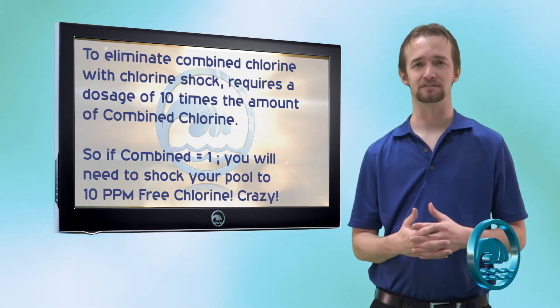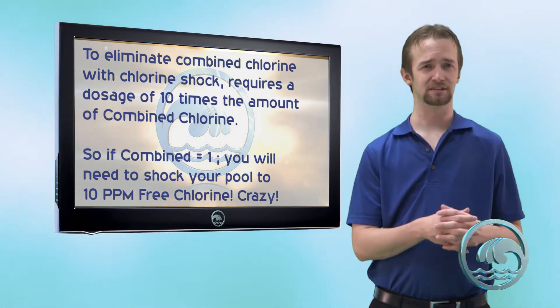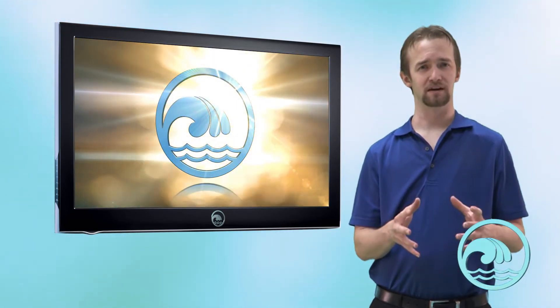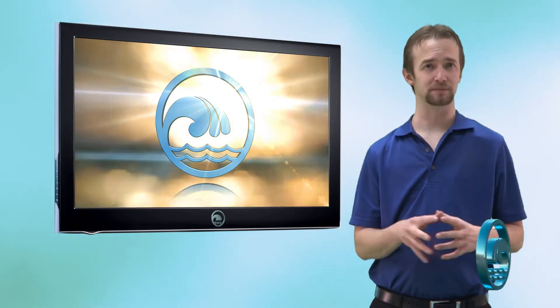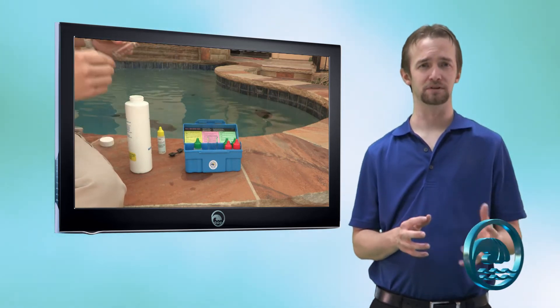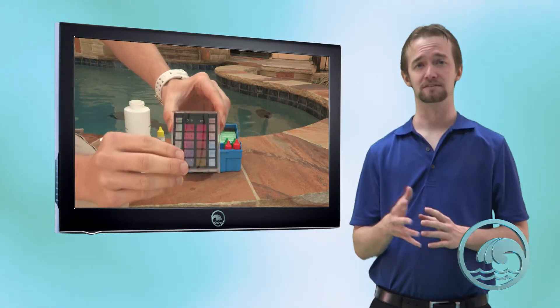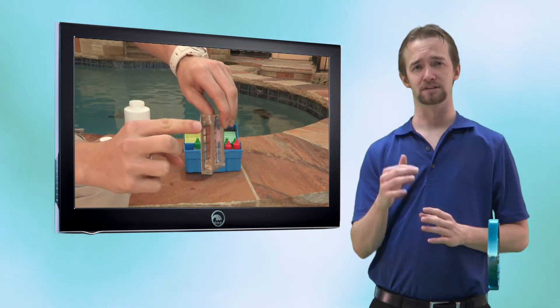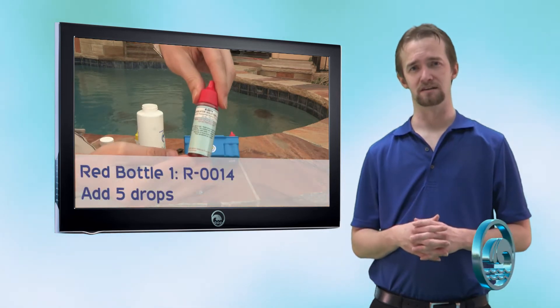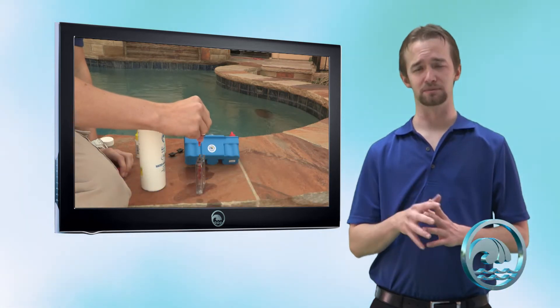I think the non-chlorine shock is going to be the way to go. That's how you test for chlorine using the K1004. Now let's test for pH. With the K1004, you can only do pH and acid demand — there is no base demand test in this kit. Go ahead and empty the chlorine water sample back into the pool and rinse the compartment. Now use the other compartment on the opposite side for the pH. Take your water sample and fill this compartment up to the notch at the top. Taking R0014, the K1004's version of the pH indicator liquid, do five drops. Make sure the bottle is completely inverted.